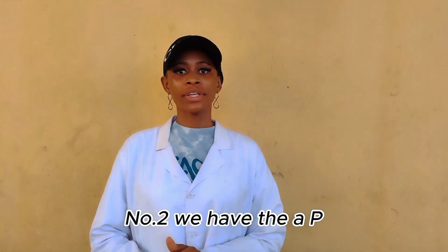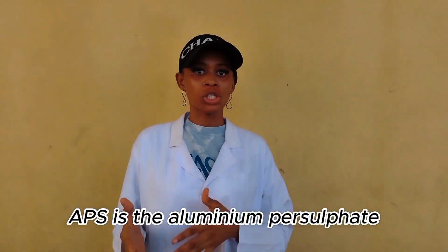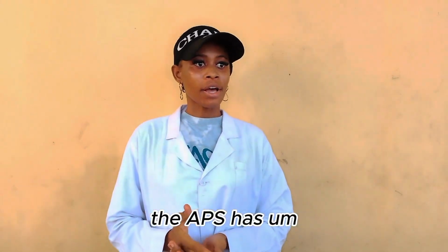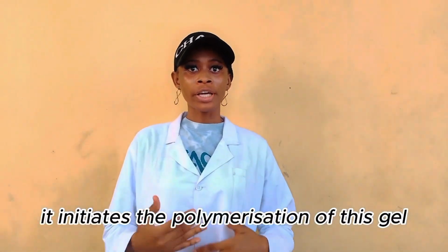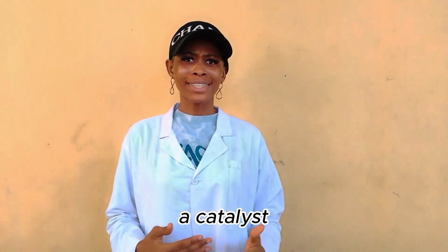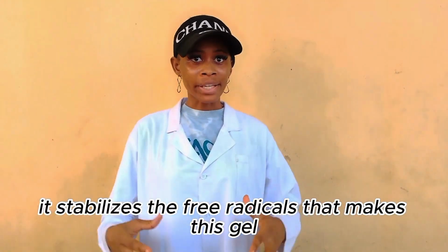Number two, we have the APS and the TEMED. The APS is the ammonium persulfate. The TEMED is the tetramethylethylenediamine. The APS produces the free radicals used in making this gel. It initiates the polymerization of this gel, while the TEMED acts like a catalyst. It stabilizes the free radicals that make this gel.